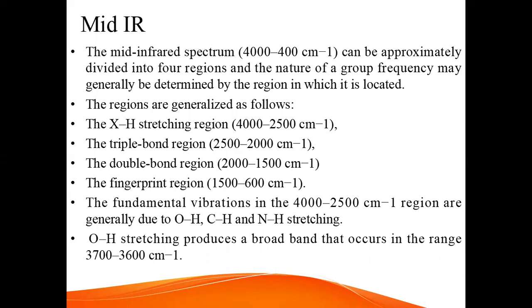The fundamental vibrations in the 4,000 to 2,500 per centimeter region are generally due to oxygen-hydrogen, carbon-hydrogen, and nitrogen-hydrogen bond stretching. Oxygen-hydrogen stretching produces a broad band that occurs in the range 3,700 to 3,600 per centimeter.